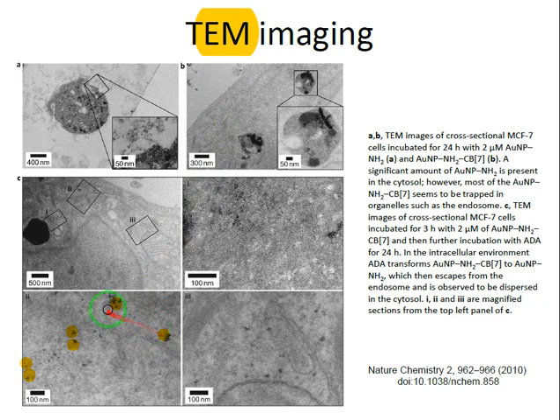When the gold particles are present in the tissue or cells, they can be detected as the black spots here. And this detection can be used to see where the nanoparticles are going, whether they have been internalized by the cells or not. And that's it.